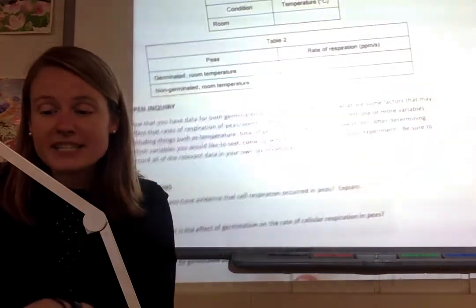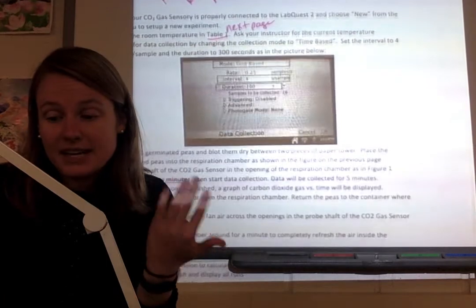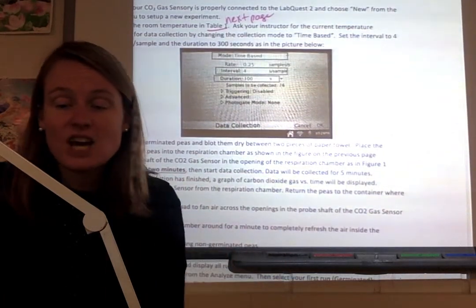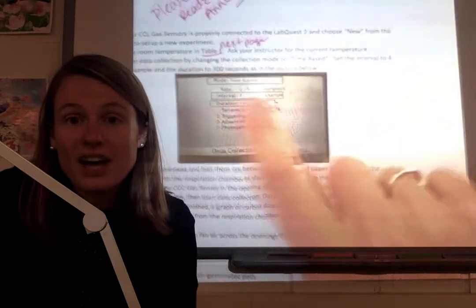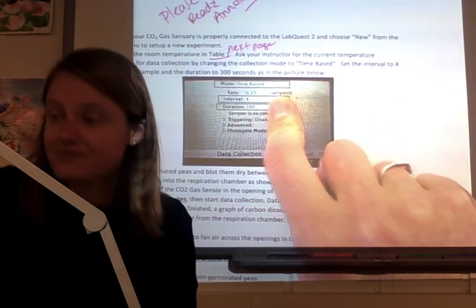In the protocol, it tells you how frequently to record the data. Like, is it every 5 seconds? Is it every 2 minutes? Is it every 5 minutes? So you have to pay attention to how frequently they want you to set your lab quest to collect the data.